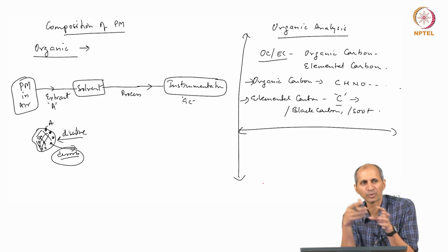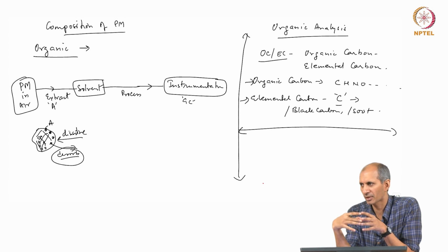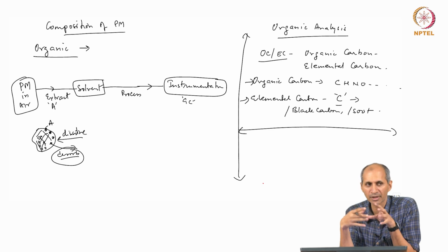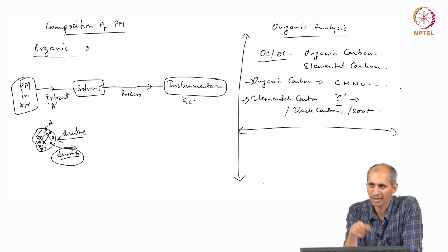It's very difficult for me to pull out all the particulate matter. So, I am better off if I am doing mass balance. If I say in a filter paper I have X micrograms of particles, I would like to do a mass balance on that. I would like to know how much of this X micrograms corresponds to carbon or some element. So, I need to capture everything, I do not want to disturb it. So, I take the filter paper and extract it as it is.